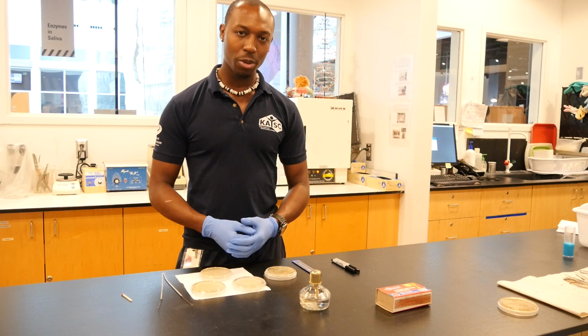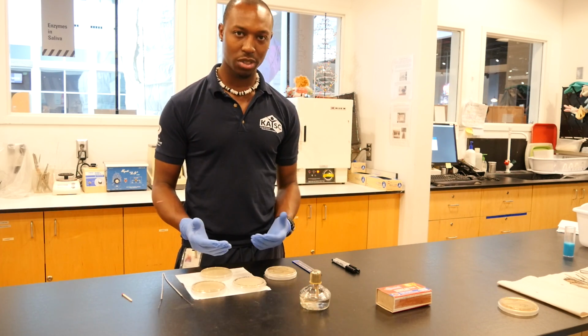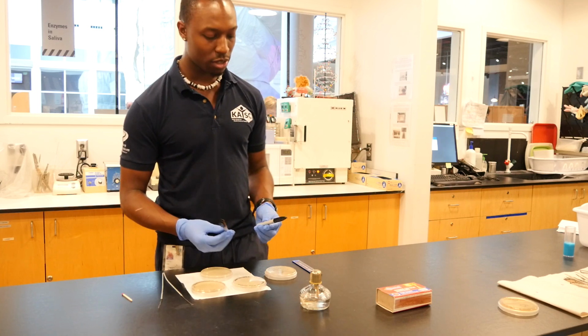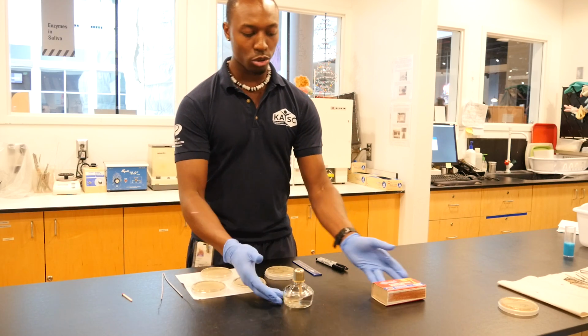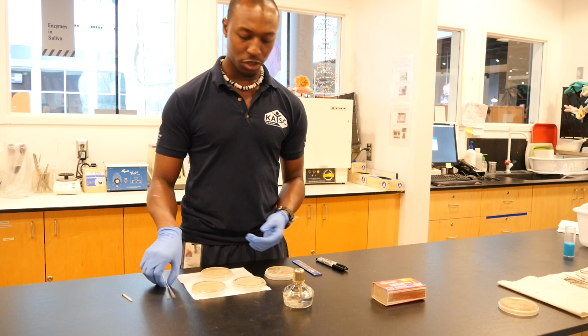Alright, the experiment that we're going to be doing right now is streaking split plates. I'm going to go briefly over the materials that we have, okay? Right now I have a marker, which is the thick marker, and a fine marker. I'll tell you guys what it is and what it's used for down the road. We have the matches, we have the alcohol burner. As you can see, I'm also giving those two some space. Be organized when it's called for safety, okay?